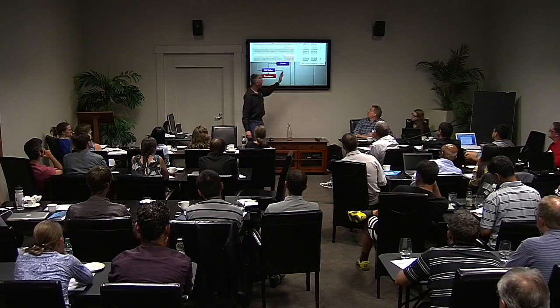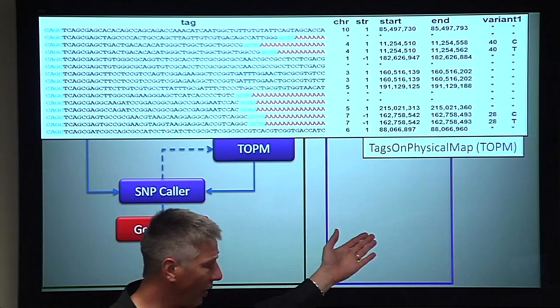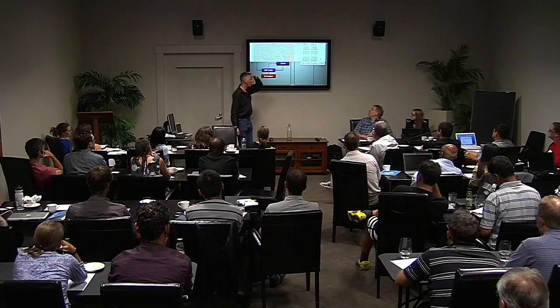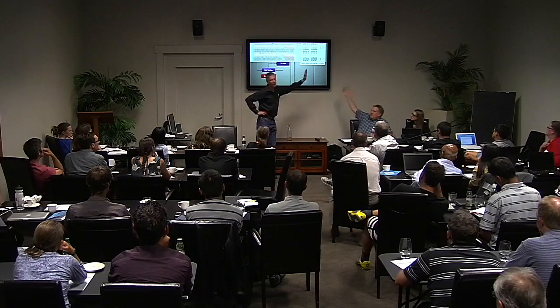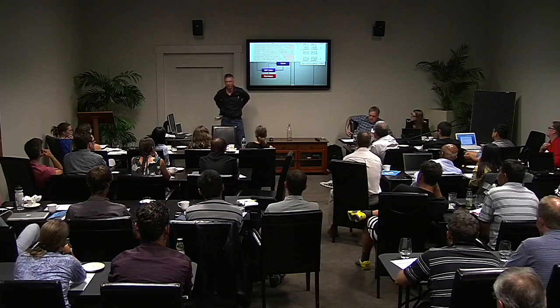And at the moment, the limit of that, I haven't been around long enough, does that change? Do we still only have 8? No, 16 is by default. 16 positions by default? Yeah. Okay. So this is only showing one variant, but we can store up to 16 variants per 64 bases.